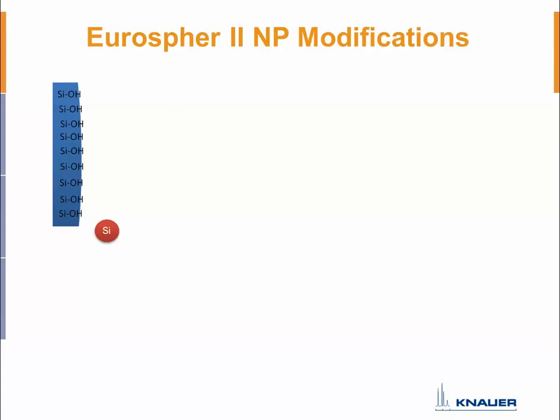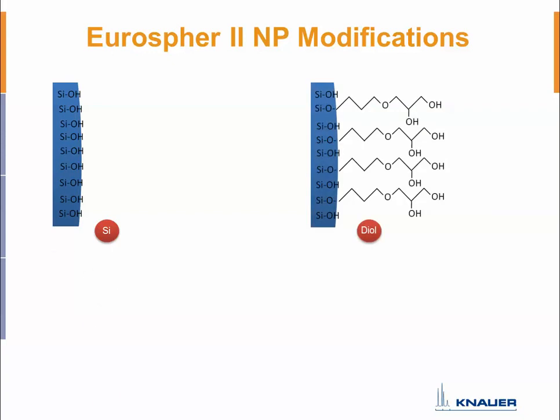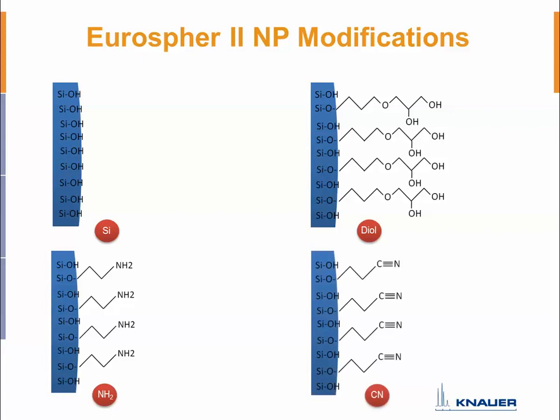Now we talked about reversed phase columns, but let's also have a short look at the normal phase columns. In normal phase mode, you typically use bare silica gel phases or diol phases, or also amino phases or cyano phases. This is typical because in normal phase you use really hydrophobic eluents, and your molecules interact with these polar phases. So it's really the other way around than in reversed phase mode.